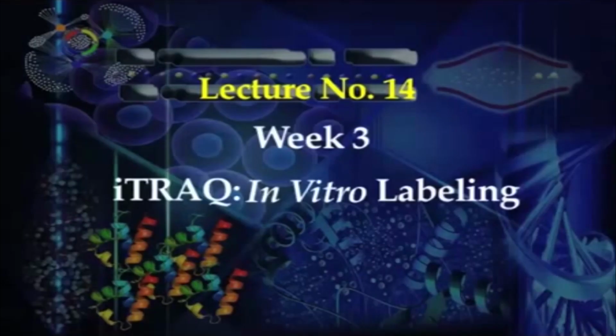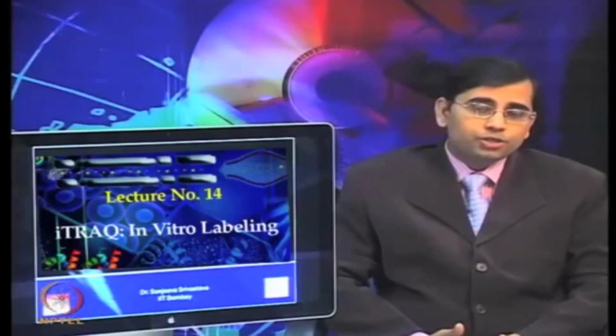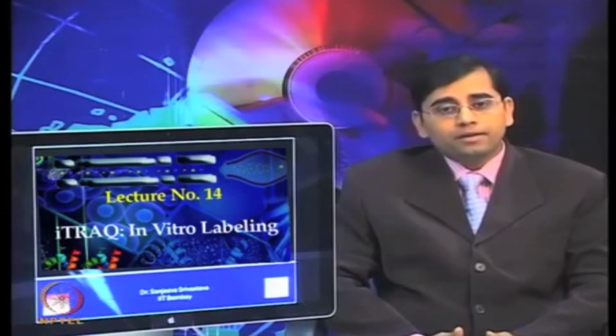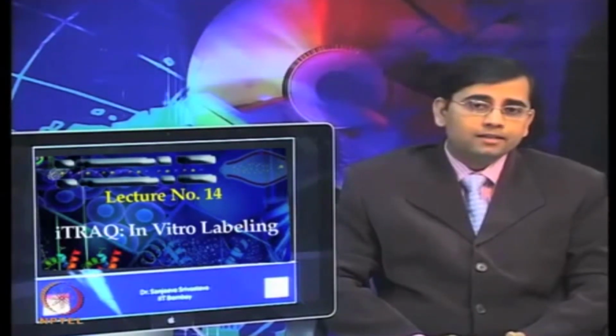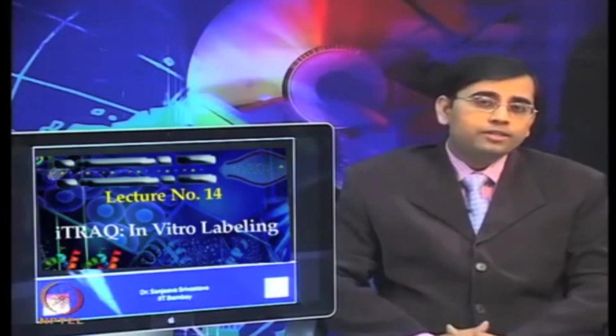Today we will talk about quantitative proteomics and discuss iTRAQ. Quantitative proteomics aims to answer various questions, including the identification of biomarkers for various diseases and target identification for early diagnostic intervention.